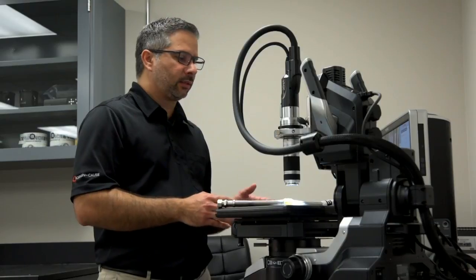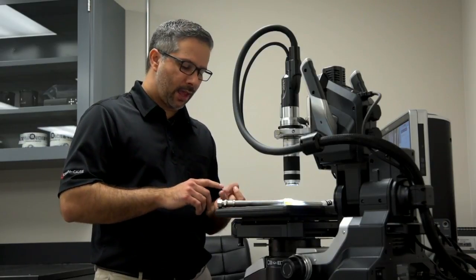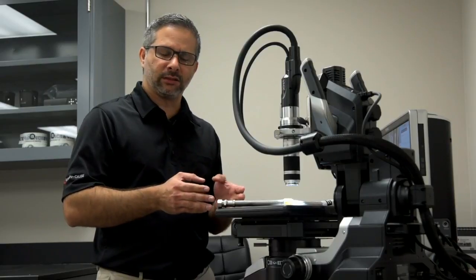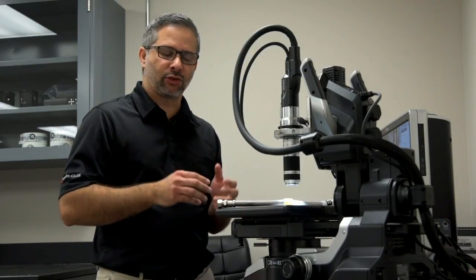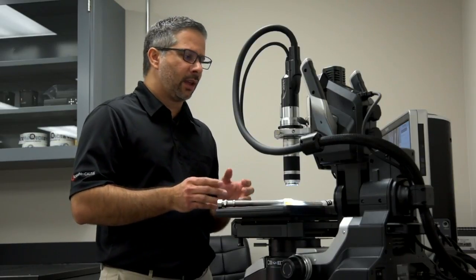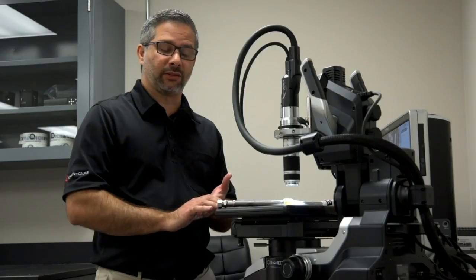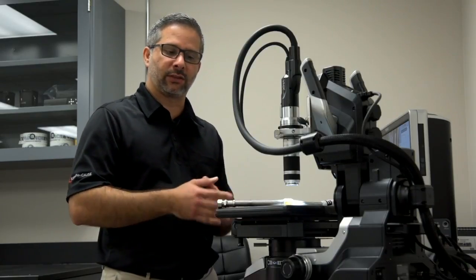In this particular case, I want to look at what the chemistry of the material is and what the microstructure is. In essence, if the chemistry of the material, in this case a stainless steel, is off, not within a certain range, then the corrosion is going to take place and we're going to see this type of failure. But sometimes the chemistry is ballpark within range and the microstructure is off, and that's another issue that can cause this kind of failure.